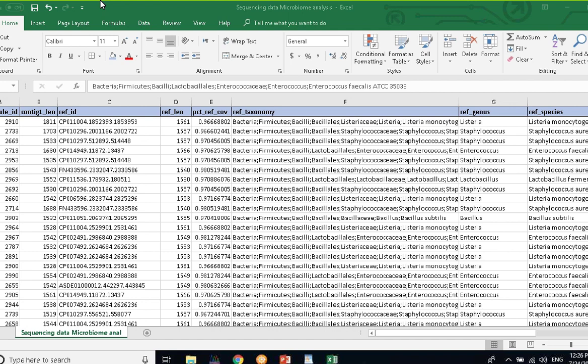That's excellent. Thanks very much for the information. Just one final comment from myself. It would be really, really interesting, when you do the shotgun metagenomics analysis, in a webinar in the next couple of weeks, if we were able to see a comparison of some matched samples via shotgun metagenomics and also via your 16S library prep. The correlation between the two would be very interesting.